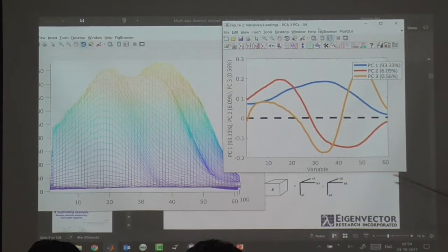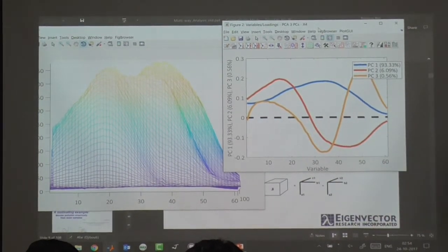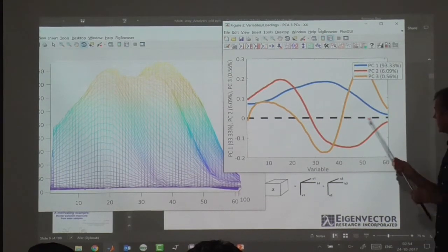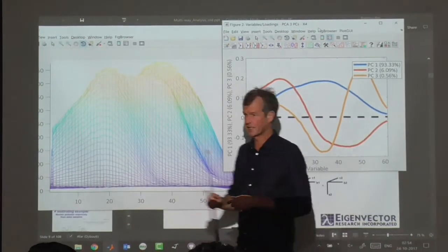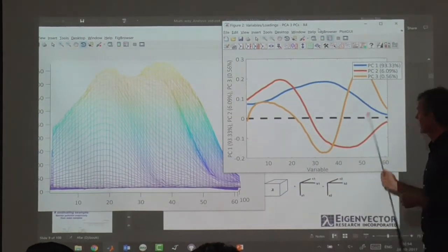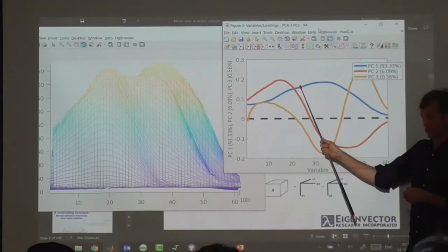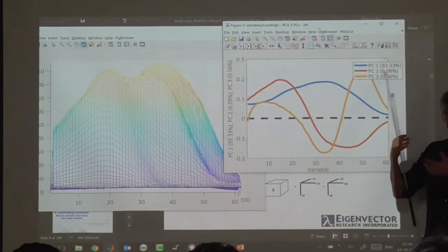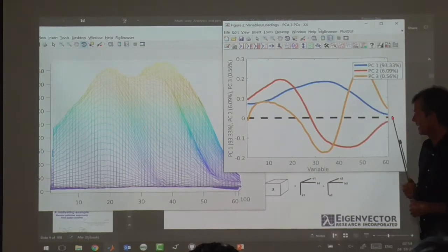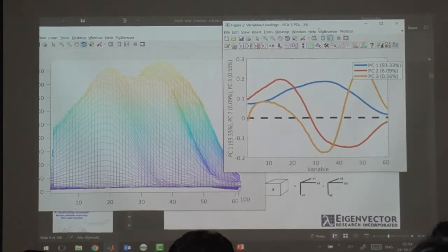These are all the emission spectra that I measure, and I get loadings like this. If you are used to doing PCA, this makes sense. The first component looks like the overall shape of my excitation spectra. And the second and the third ones are more difficult because they are forced to be orthogonal to this one. So I'm not getting the real chemistry, but I'm getting something that reflects the underlying information. And that's what we normally get out of PCA, so that's perfectly fine.